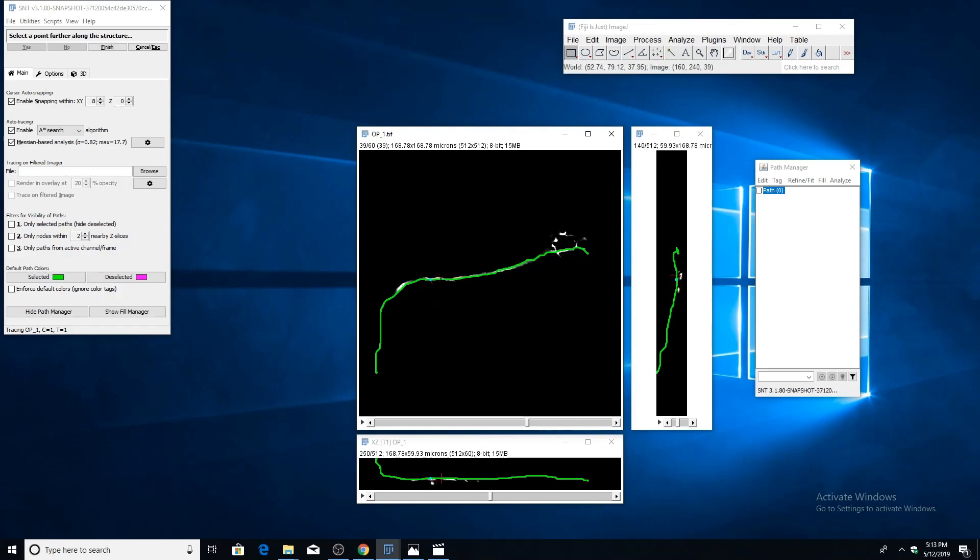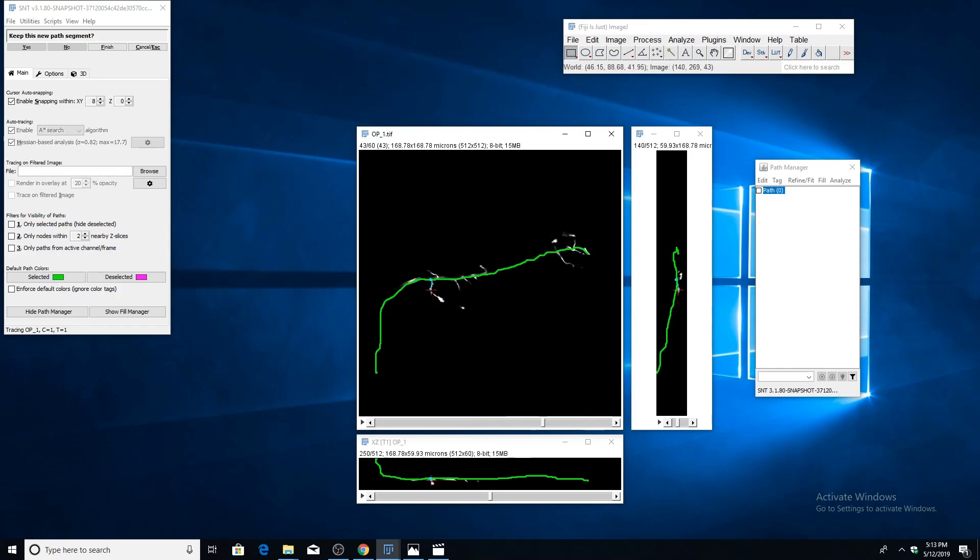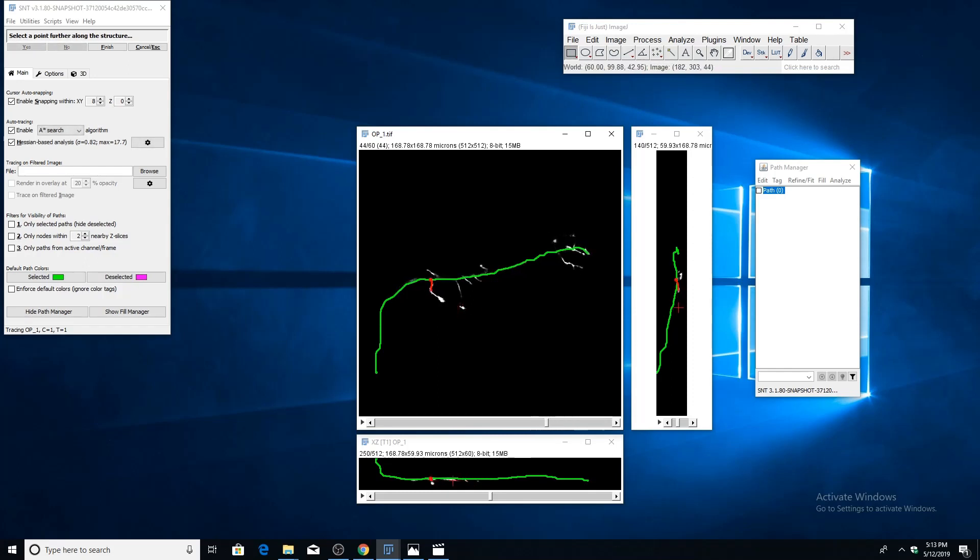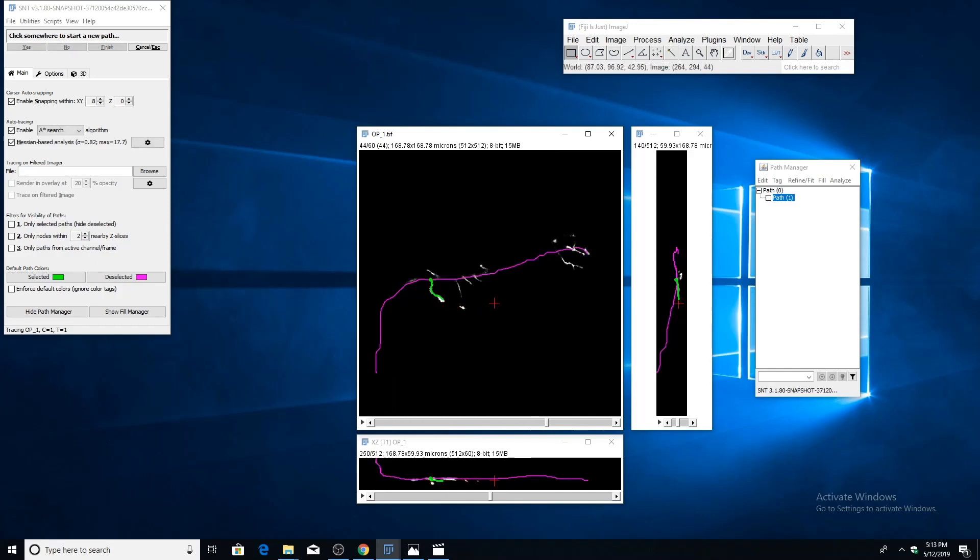Then we can just continue along as usual: just create new points and then confirm or deny the temporary segments until you reach an endpoint or you can finish the path.